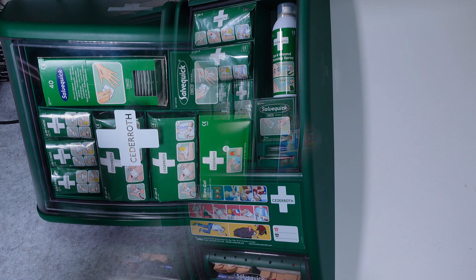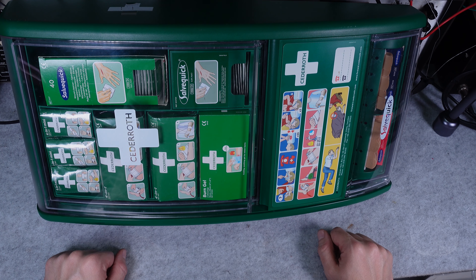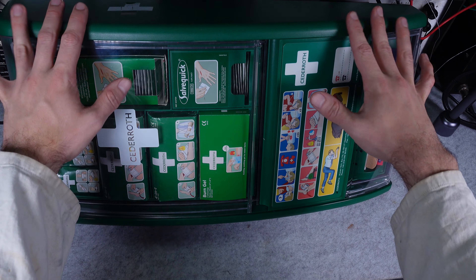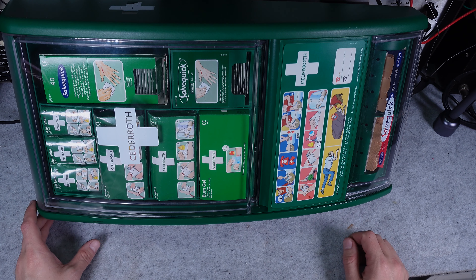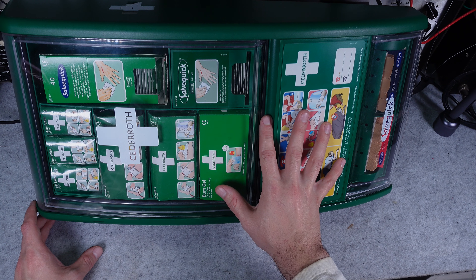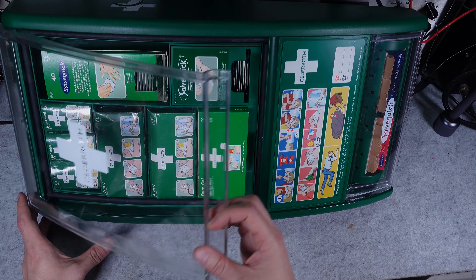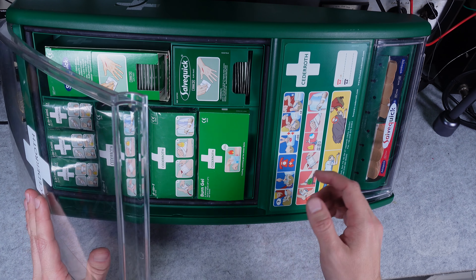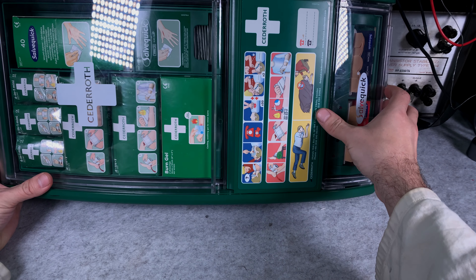I'm back at my desk so I have the opportunity to show you that first aid kit station much closer. The first thing is it's screaming high quality and I absolutely love it. The first aid station is divided into three compartments; two of them have a clear window and around them you've got a seal so they are protected from the environment — water droplets or dust are not going to penetrate.